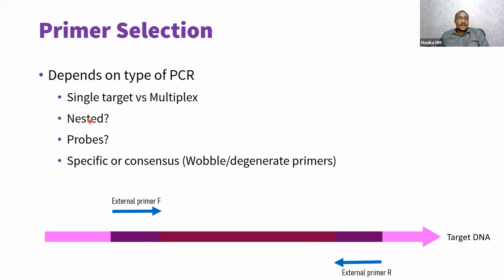And you can also have a nested primer to complement this. So maybe you want to be more specific, or you want through the nested primer to identify something else. So after amplifying this in the first round, the first, say, 40 cycles, then you can put in another PCR, but now instead of getting the template from your sample, you get the template from the amplicon, from the PCR that you have run.